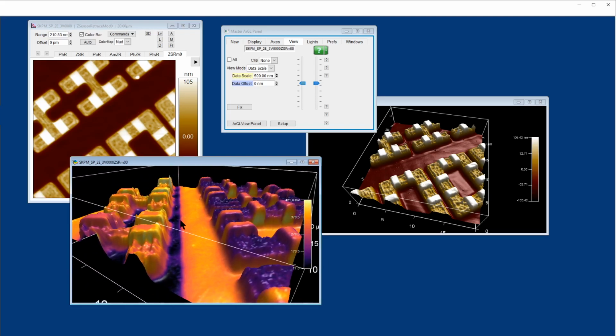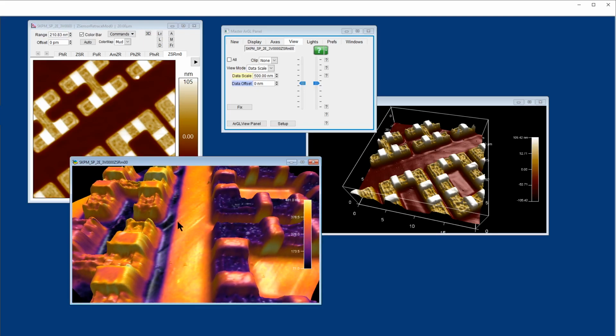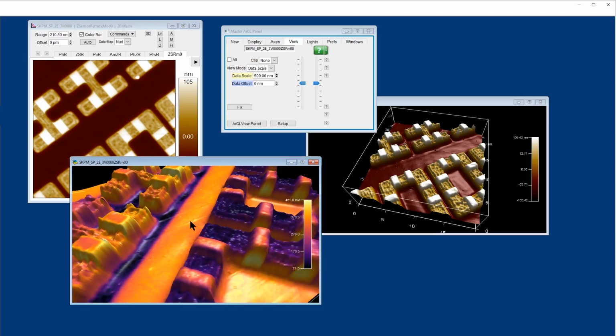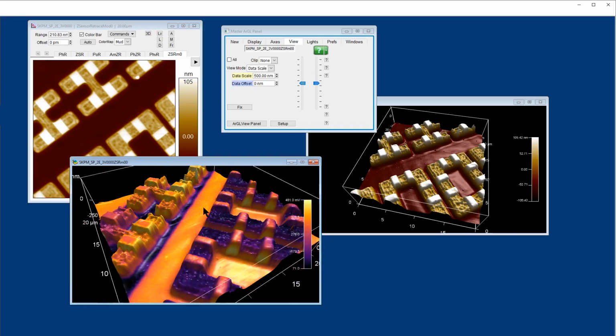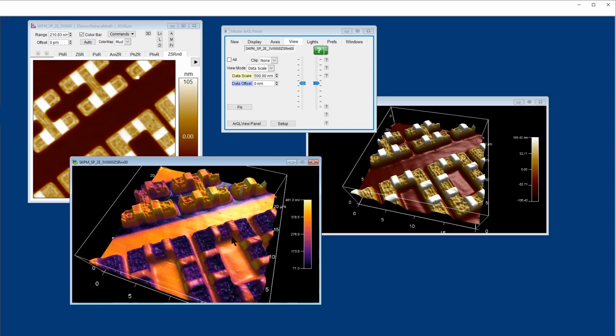And in this case we have a relatively flat surface, but we have a jump or a change in surface potential. So this helps us correlate different complementary data sets with our 3D topography and gets more information from our data sets in AFM.